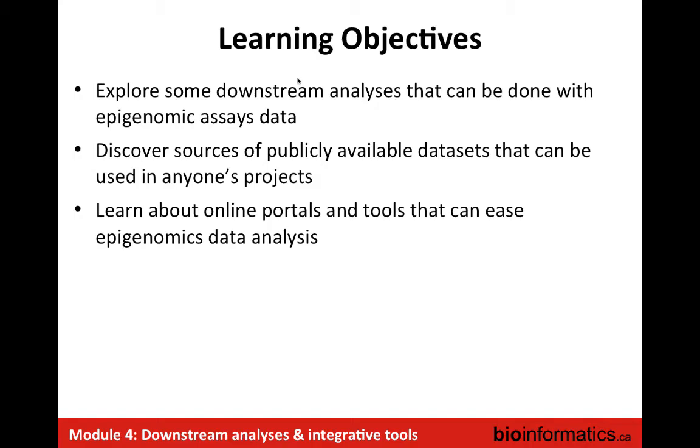The objectives of the lecture this afternoon will be, first, to explore some types of downstream analysis that can be done with epigenomic assays, although Misha already went into some parts of that yesterday at the assignment at the end of the day. We'll also cover sources for publicly available data sets that anyone can use in their own projects, either for a full analysis on public data sets or to compare to their own data set that they produce within their team. And we'll also cover online portal tools that can help with data analysis and offer tools to do sometimes the same kind of thing that you've been doing from the command line. We'll come back to that.